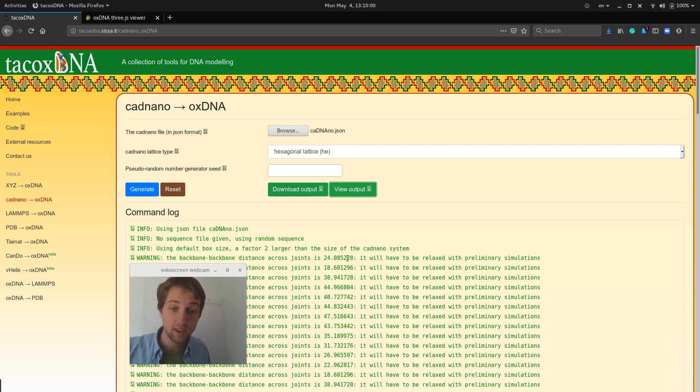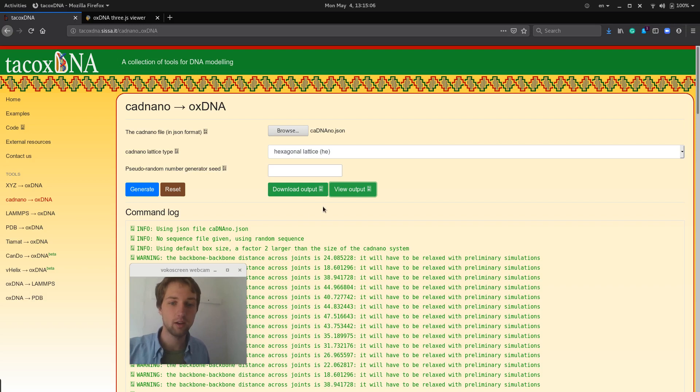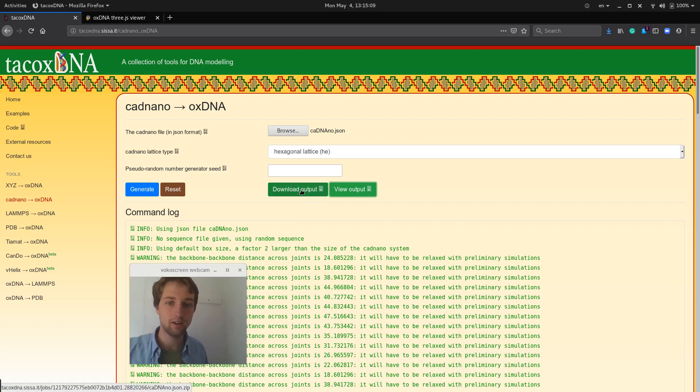You also see here in the output that it does complain about the backbone distance being very long for some nucleotides, which is another indication that we need to do some relaxation.